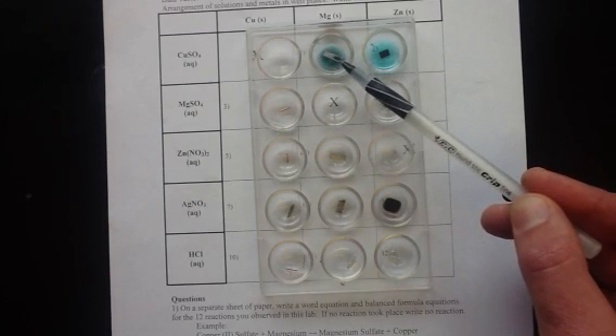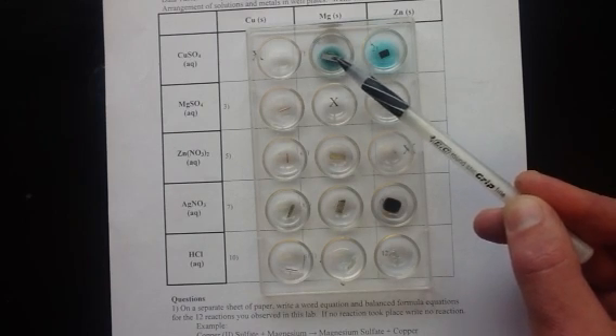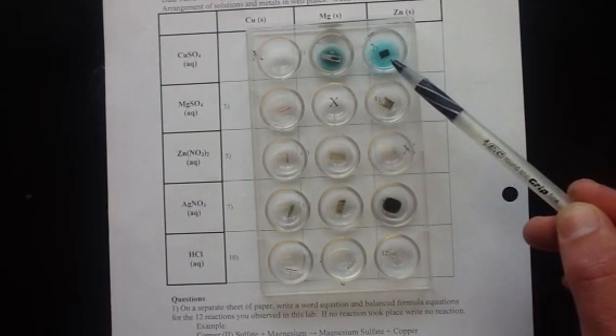In this first one we have a reaction taking place. You can see that the magnesium is going into the solution and it's starting to be coated by copper on the outside of the magnesium metal. There's also a reaction taking place here with the zinc - the zinc metal is being coated by copper and the zinc is starting to go into the solution.